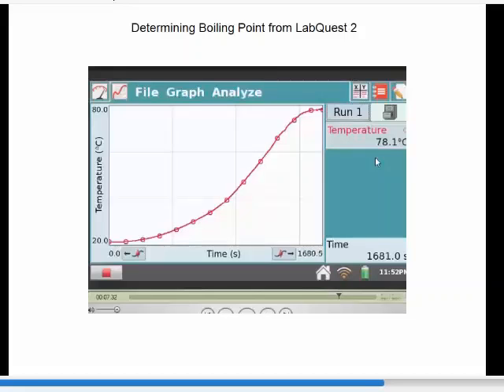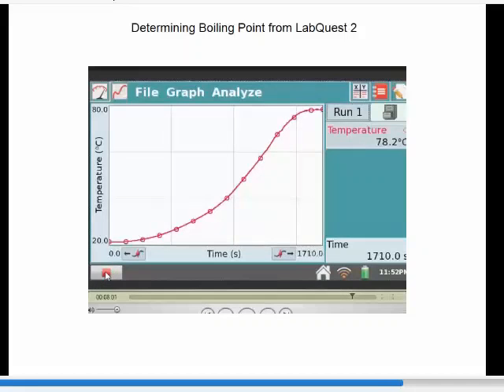And I'll show you how you can get an average boiling point. This is pretty much going to be 78.1, 78.2 degrees, somewhere in there. I actually looked this one up before I did it, and the boiling point of this was around 79.4. That was probably Wikipedia, but that was the boiling point of this material. So we're pretty well in range of that. So I'm going to go ahead and stop this run.